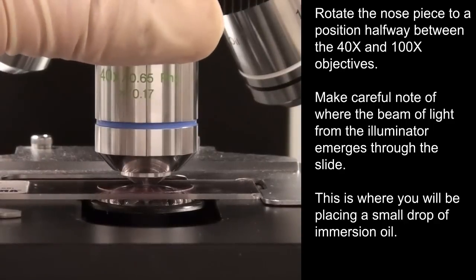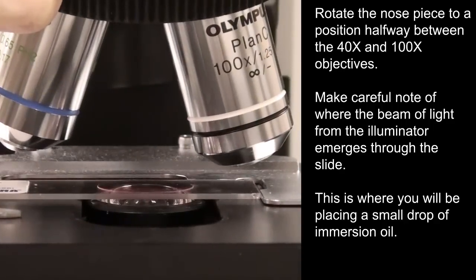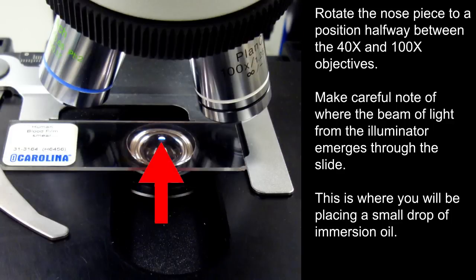Rotate the nose piece to a position halfway between the 40x and 100x objectives. Make careful note of where the beam of light from the illuminator emerges through the slide. This is where you will be placing a small drop of immersion oil.